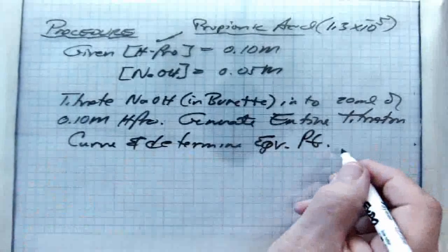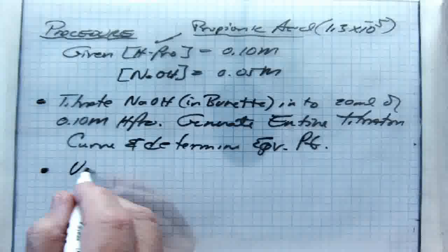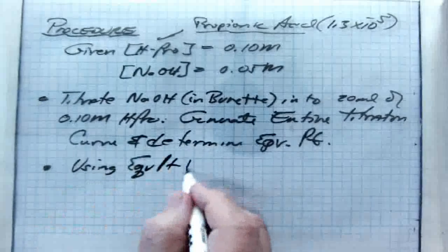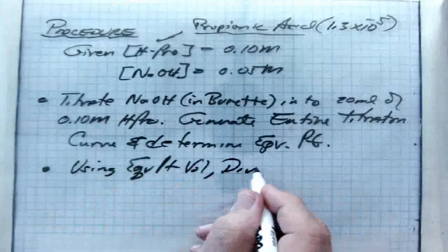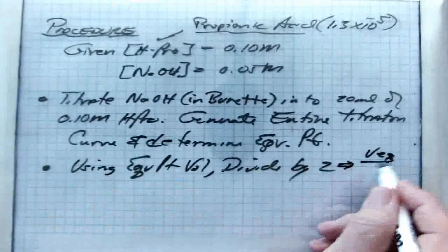For 2 titration results, calculate Ka, average Ka, standard deviation, confidence interval, and RR, range of reliability.